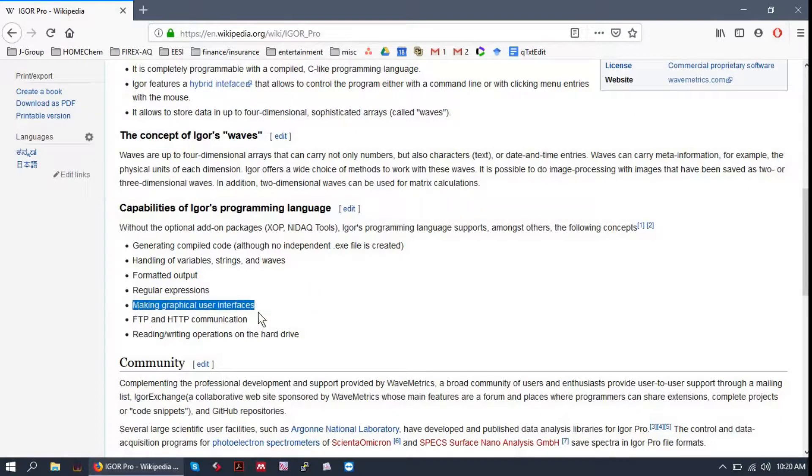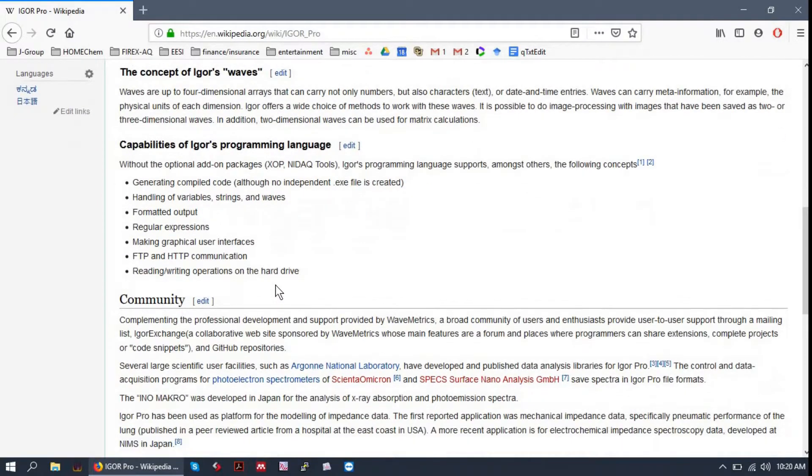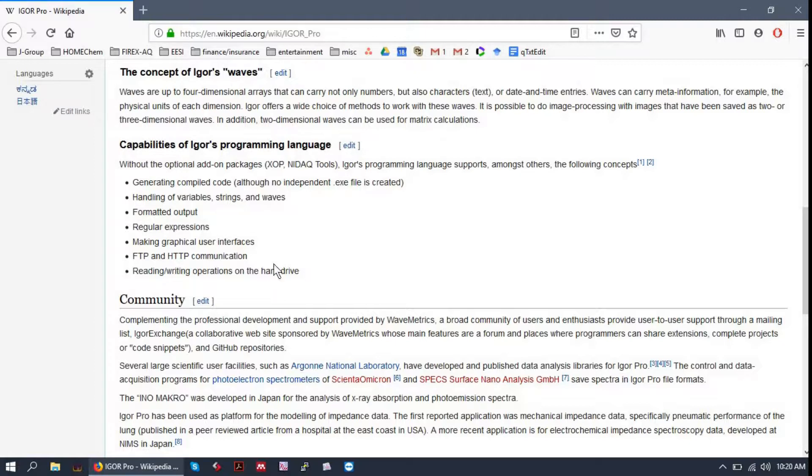You can make graphical user interfaces with Igor. So if you're making a workflow that you want others to use in the future, you can make a graphical user interface that makes it very easy to share your software.